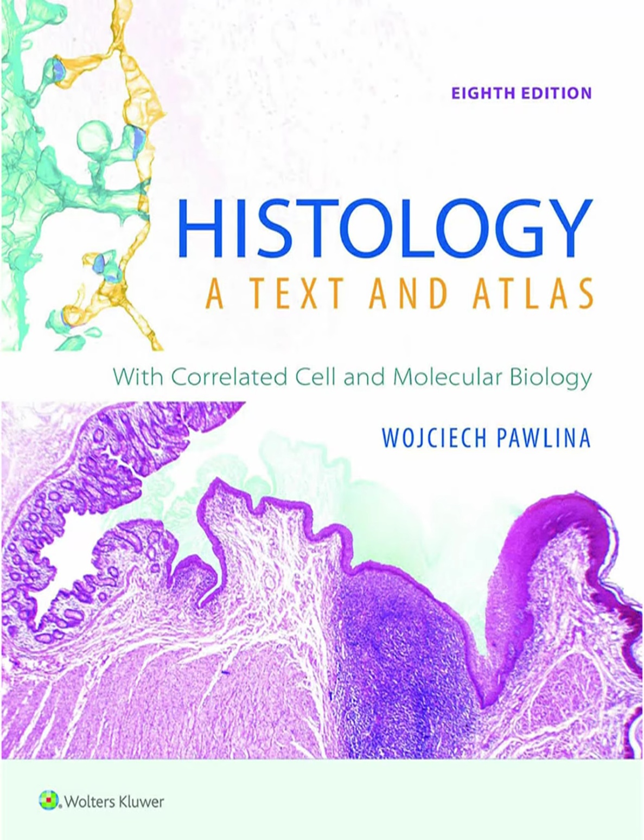Well, the fundamental concept for any microscope is its resolving power. Resolving power, not just magnification. No, magnification just makes the image bigger. Resolving power is the ability to show two closely positioned objects as separate, distinct images. That's the real measure of a microscope's quality. Okay, so how good is it?